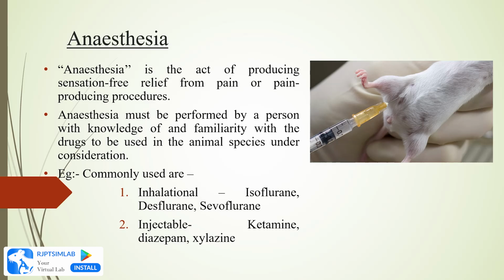The anesthesia must be performed by a person with knowledge of and familiarity with the drugs to be used in the animal species under consideration. The statement says that it should be performed by a well-trained person who has knowledge of the drugs and is familiar with the drugs that are used in the anesthesia process.